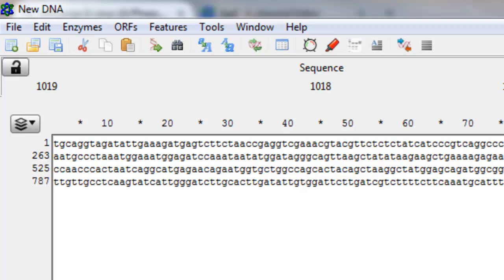So I'm going to be spending some time working in this program, because I'm not very familiar with it either. But a lot of the options, I'll just browse through it, for example, and a lot of the options are pretty straightforward, it seems. So this is a very useful program, and I highly recommend this program for any cloning project, or if you just want to look at your DNA, or annotate it, or whatever.